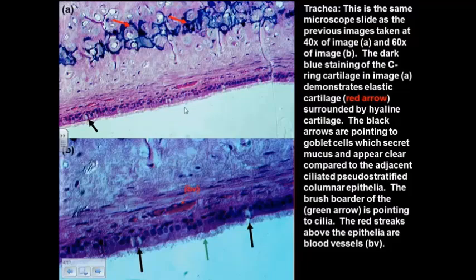Here's some nice cilia in a healthy individual. You look at higher magnification, and there they are. They work together like a wheat field in the wind. It looks like waves. And they're connected by gap junctions. That's why they can do that. Okay, it's not haphazard.